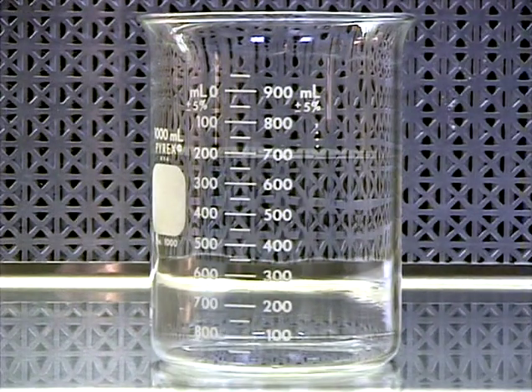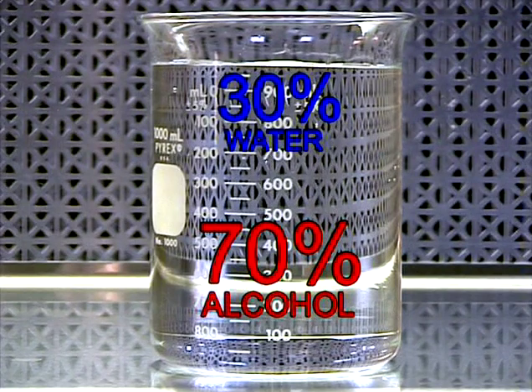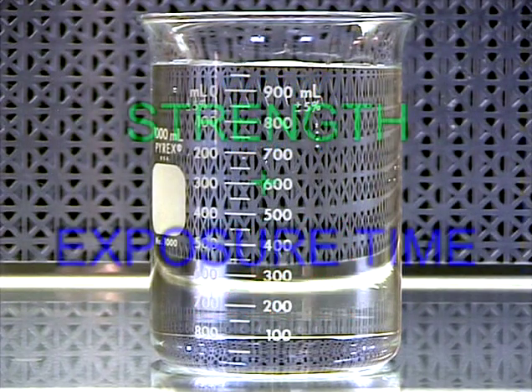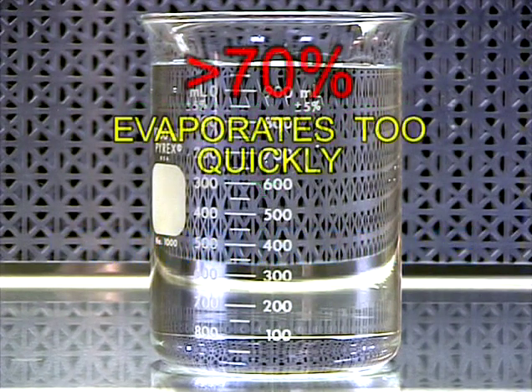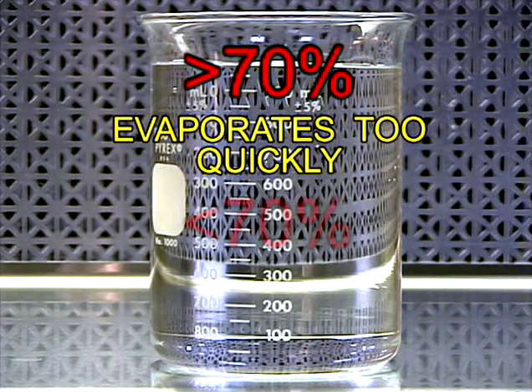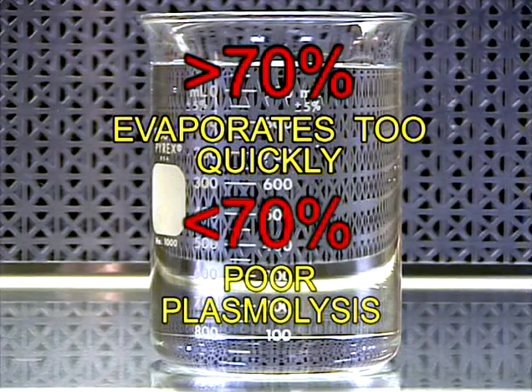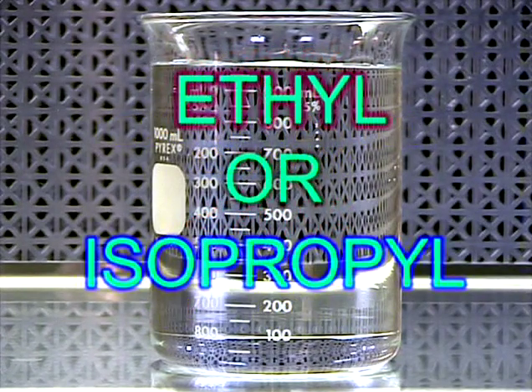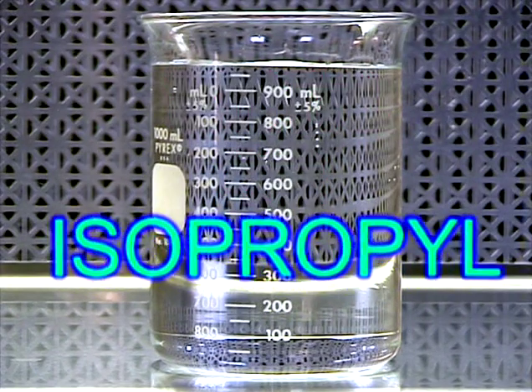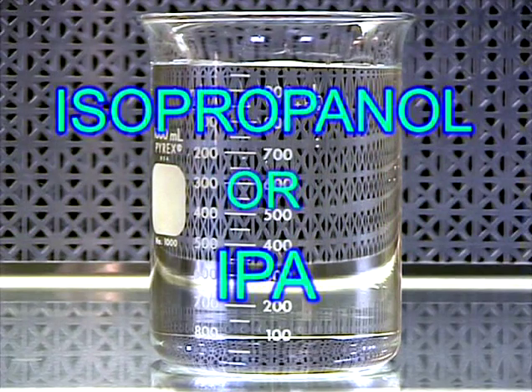A combination of 70% alcohol and 30% water is the optimum concentration for antimicrobial activity because it provides the ideal combination of strength and exposure time. Higher concentrations of alcohol may evaporate too quickly to sufficiently penetrate the organism, while lower concentrations may not evaporate sufficiently to cause plasmolysis. Either ethyl or isopropyl alcohol may be used. Isopropyl alcohol is most common and is also called isopropanol or IPA.